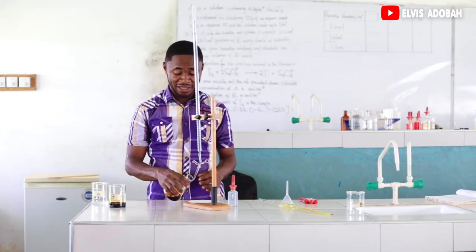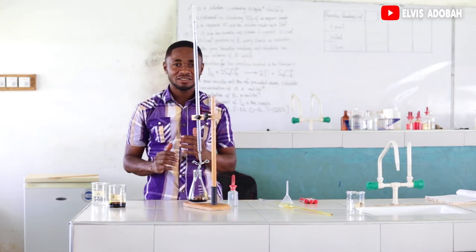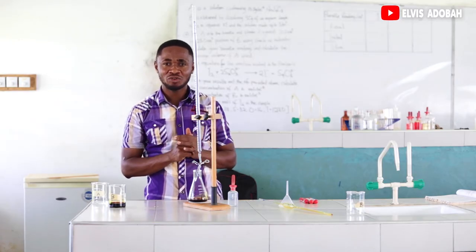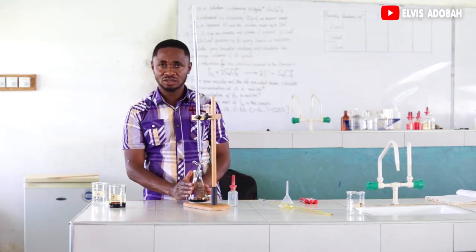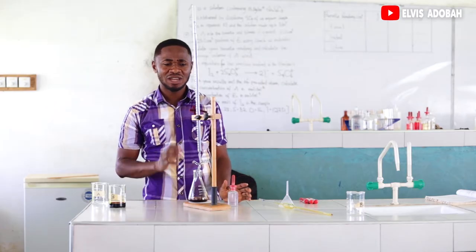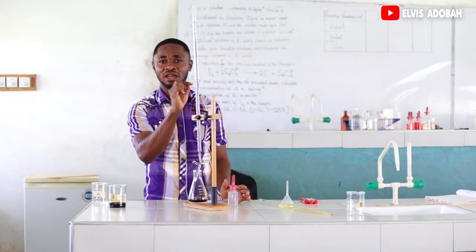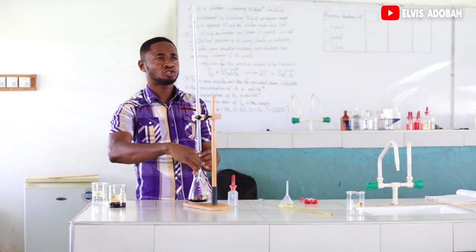Then I go for my second titration. This time I know where my titer value is hovering, around 27. And remember, we got to a point where this solution turned pale yellow before adding our indicator. So let me think about maybe 19 or 20 centimeters cubed of the solution in the burette. So I can release straight.